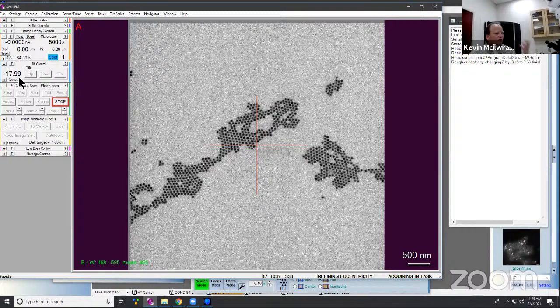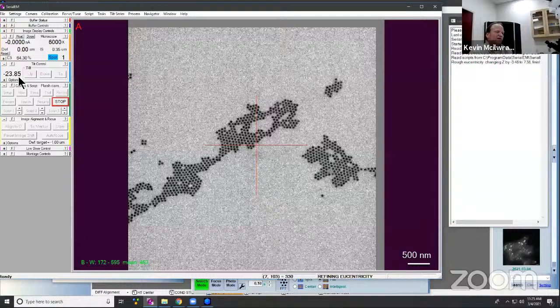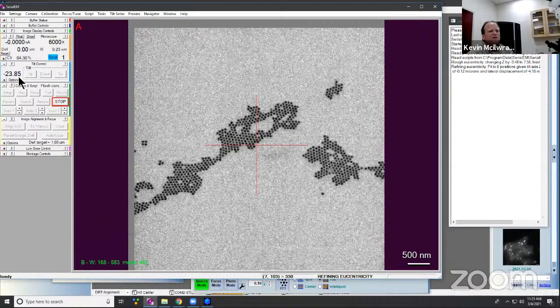There's a lot it can do, but when you're doing basic things like just room temperature tomography, something not low dose, you're doing the same thing. So it's not too big of an issue. No, it's not too difficult to learn once you've done it a couple times.